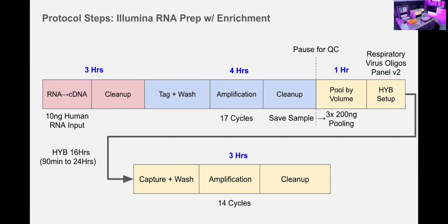In this particular case, I've left everything on the robot. I would take my sample, pause the protocol, go quantify it and dilute the samples if necessary, if any of the samples seemed a little too high. That's why, for amplification, you see I have it for 17 cycles.